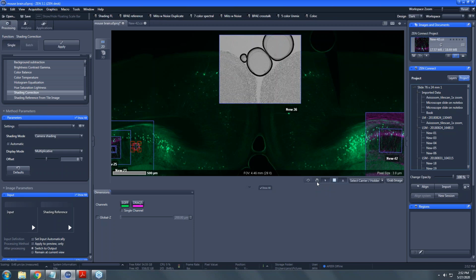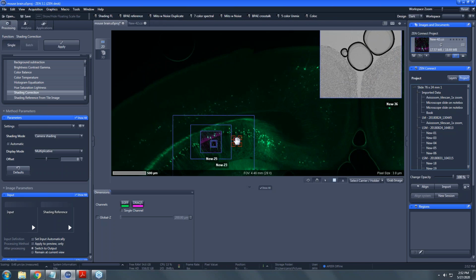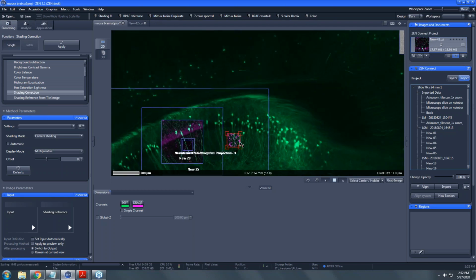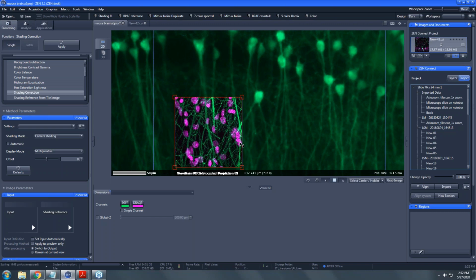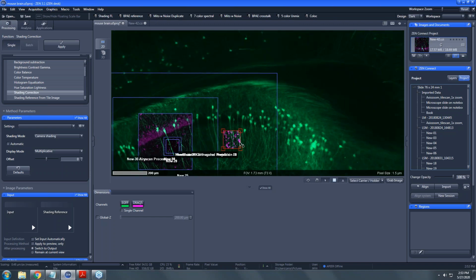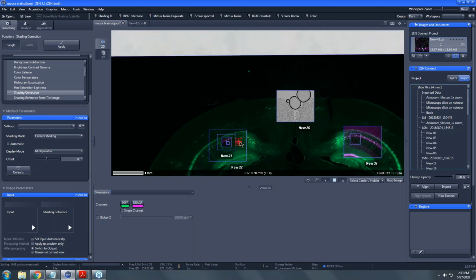It's also possible to do animations both in 2D and 3D, so that once you have these multiple images, if you wanted to, you could do this zoom out all the way, zoom in, and navigate between them. And you can put that into a PowerPoint so that when you're presenting your data to people, they have 100% idea of what the context is of the data that you've pulled out. So you're putting up that image, and instead of saying, what is that coming from and where is it coming from, they can see absolutely that it's a coronal brain slice and it's coming from this region of the brain, and et cetera, et cetera.